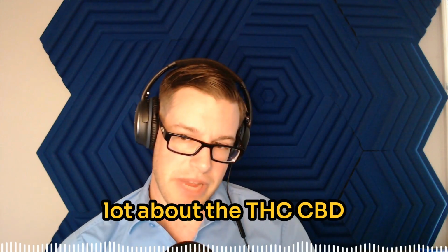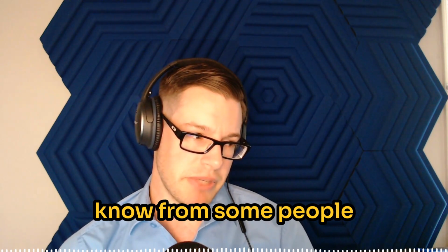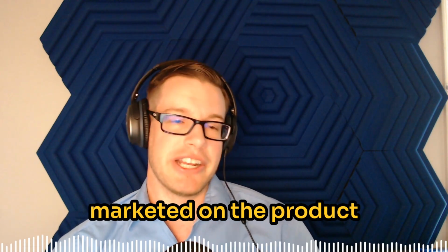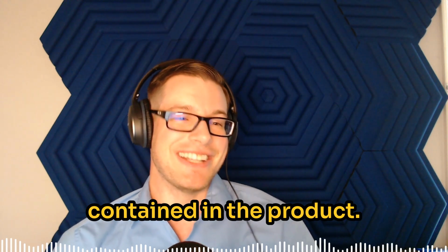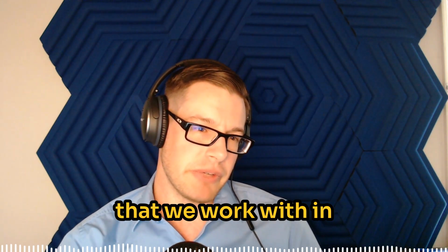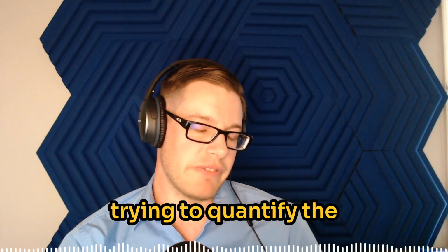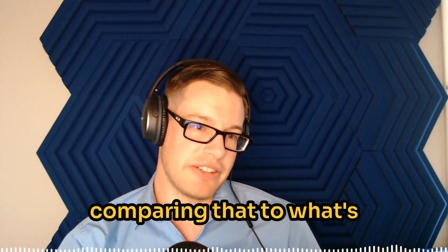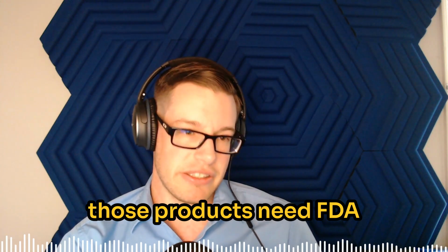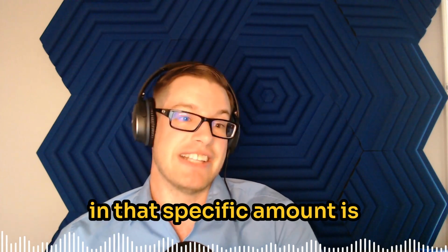I don't know a whole lot about the THC CBD market, but what I do know from some people in the space is that there's occasionally a big gap between what's marketed on the product versus what's actually contained in the product. And there's a very interesting botanical reference laboratory that we work with in California, and their whole business is literally just trying to quantify the active ingredients and comparing that to what's marketed, because all of those products need FDA validation that whatever the active ingredient is in that specific amount is actually in the product.